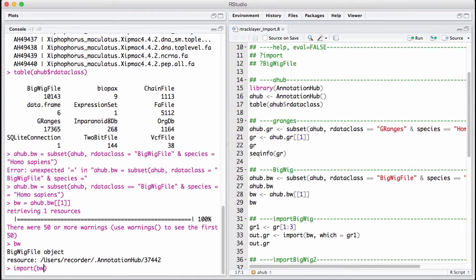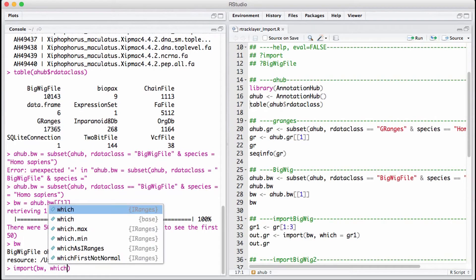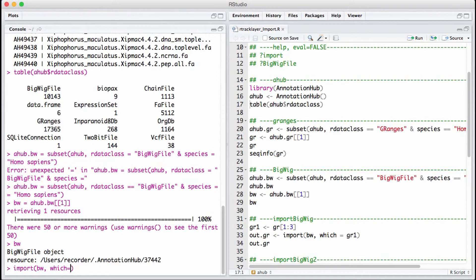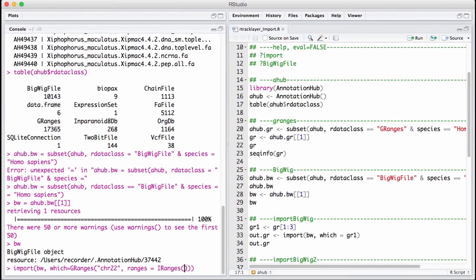However, most of the time we are just interested in reading a part of the file. We add a which argument and put it as GRanges. For this particular case, we want to read in just chromosome 22, so we specify it here. Since I don't know how big chromosome 22 is, I'm just going to put in a range. I definitely know it's not bigger than 10 to the 8th, so that's the range I'm going to put.